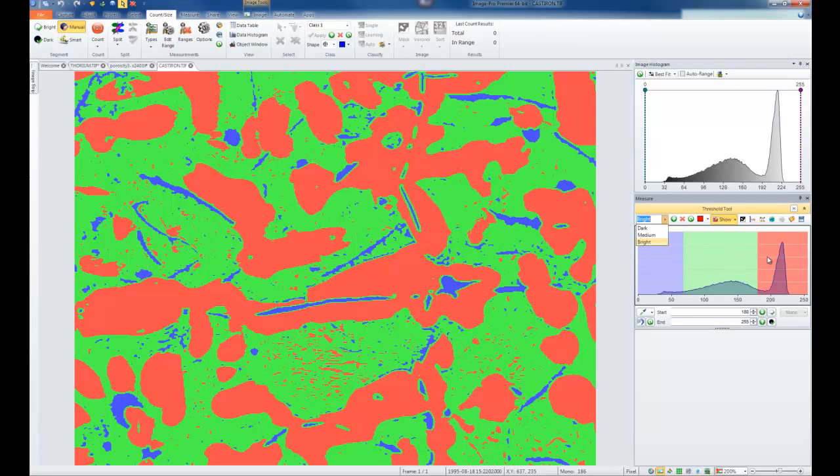If I wanted these segmentations to ever overlap, I have the option to do so with Allow Overlap. Right now, without this checked, there is no overlap allowed. If I didn't want to simply drag my selection, I could always use the eyedropper tool with a specific size of selection. 1x1, 3x3, or 7x7 gives me different selection sizes, which picks either less or more pixels to sample from. By simply selecting my eyedropper, I get a tool that will display all of the intensities under my mouse.